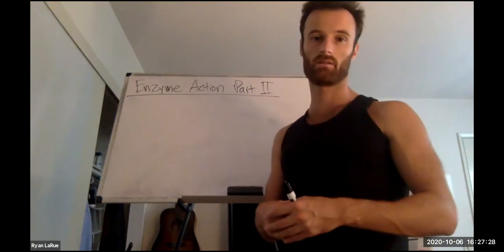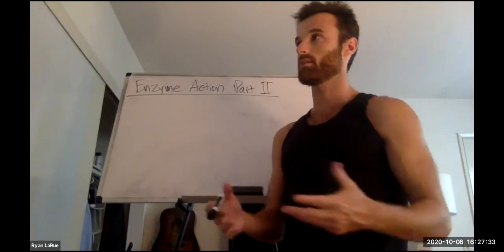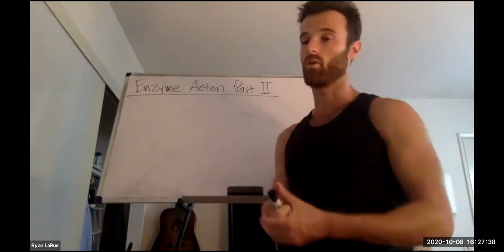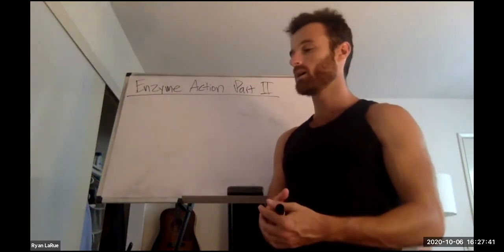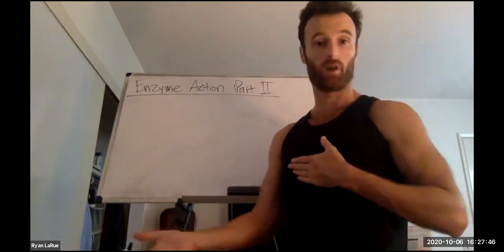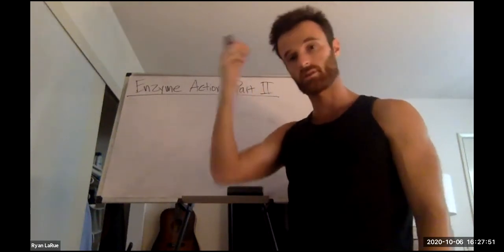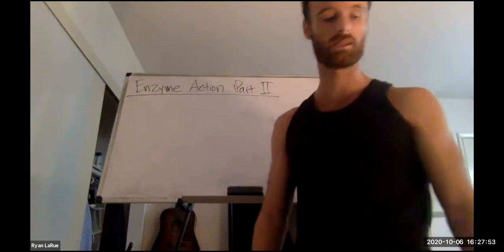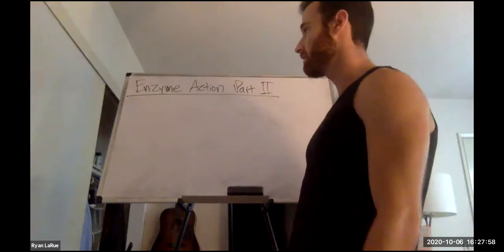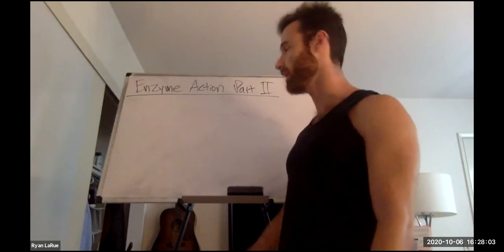And we're going to see that certain environmental conditions, such as excessive heat or acidity with pH, will affect enzyme structure, the structure of the protein, and therefore the function, which can be pretty bad. These enzymes, all of them are very useful in our cells, so we don't want that. But it's important to understand what's going on so that we can monitor it and learn about it.